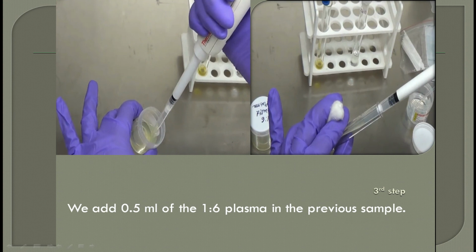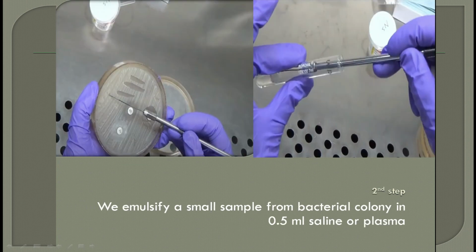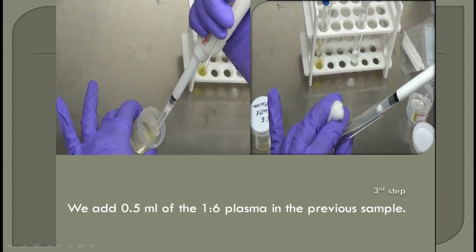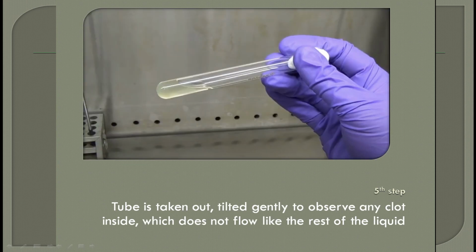Okay. Now, this test tube where the 1:6 diluted plasma and the bacterial colony emulsified in the 0.5 ml saline solution or plasma solution are held together is incubated for 4 hours at 37 degrees Celsius. Finally, the tube is taken out and tilted very gently, and we observe any clot inside.